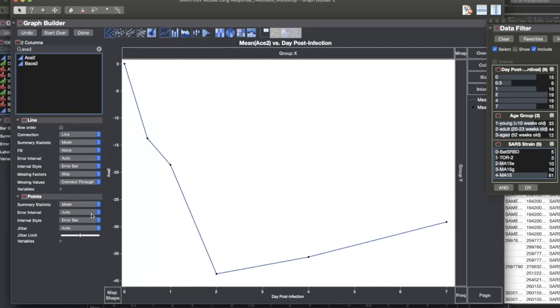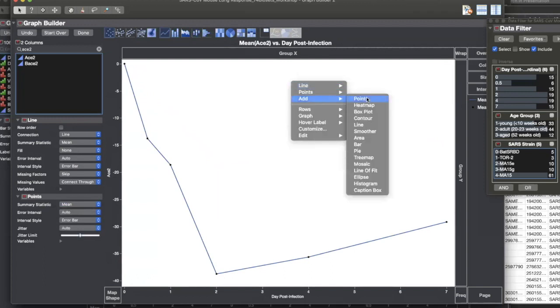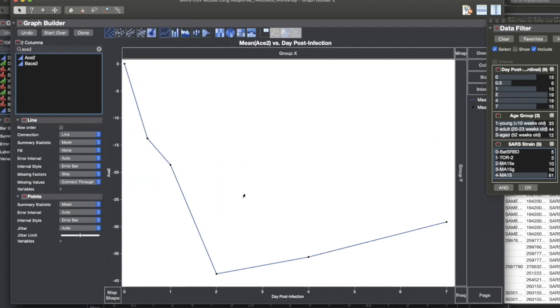Okay, is everybody with me? So I don't see the points drop-down menu. I'm not sure why, but it's not showing up for me. Okay, and you went on to the space, you said add points. Did you put that in? I did it again and it worked. Thank you. Okay, great. All right, cool.